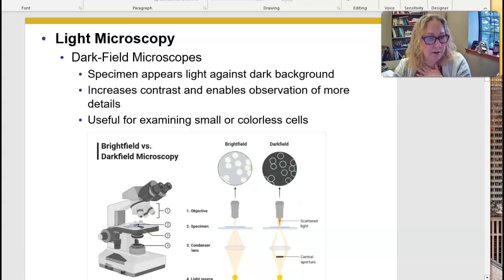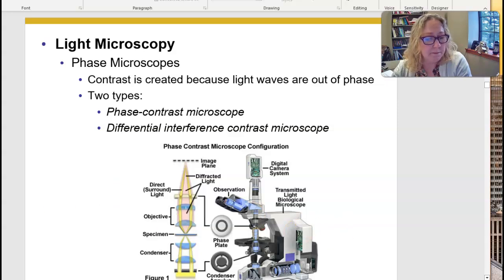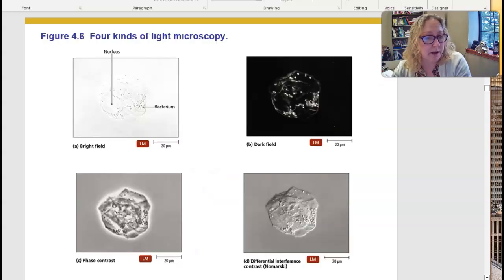So some of you are going to be stellar with the microscope and some of you are going to be like, can you come focus this? Can you come focus this? Which is fine. I'll do it a bunch of times because you just have to fiddle with it. And sometimes it takes me 20 minutes just to focus something. So don't feel bad.